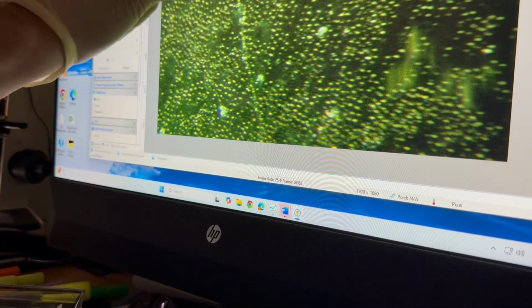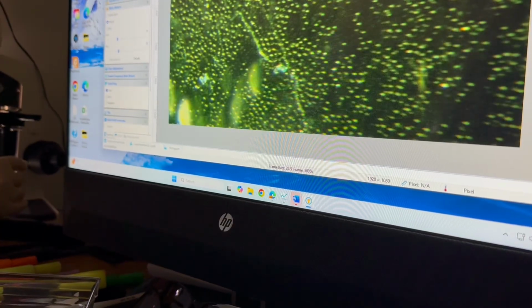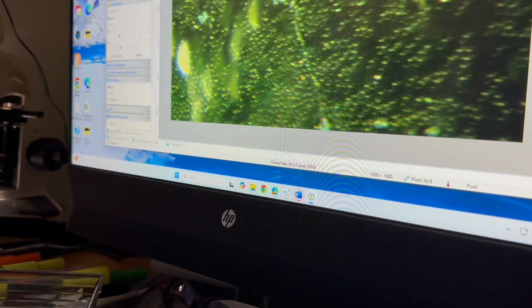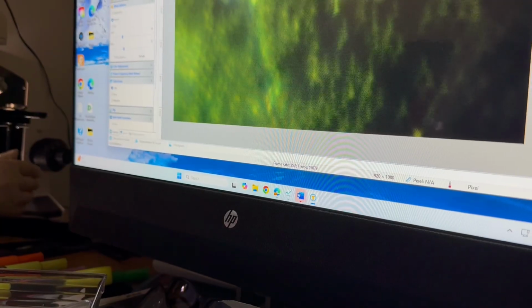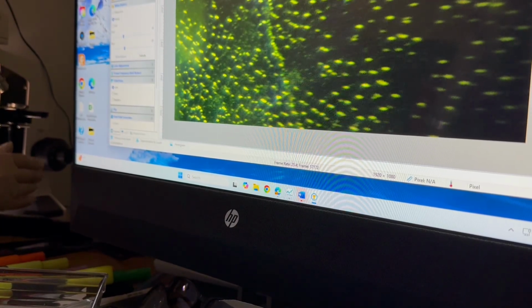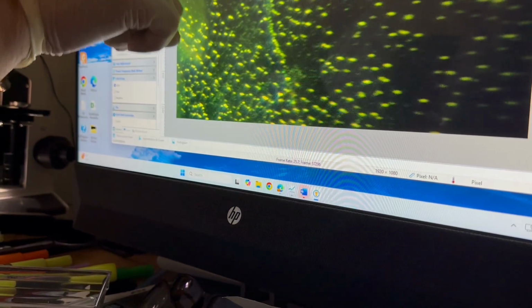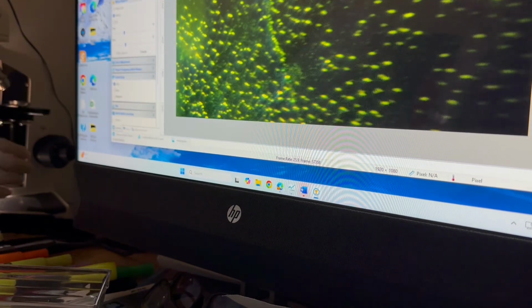And then it's got a white blood cell attacking it. So something's going on there, where the body's going, hey, I need to actually go after this. Good. Right, that's what it's designed to do. Oh, and there's the end of it right there. Can you blow that up and take a closer look? So you can get a sense that there's something there. And the white blood cell is doing its job.